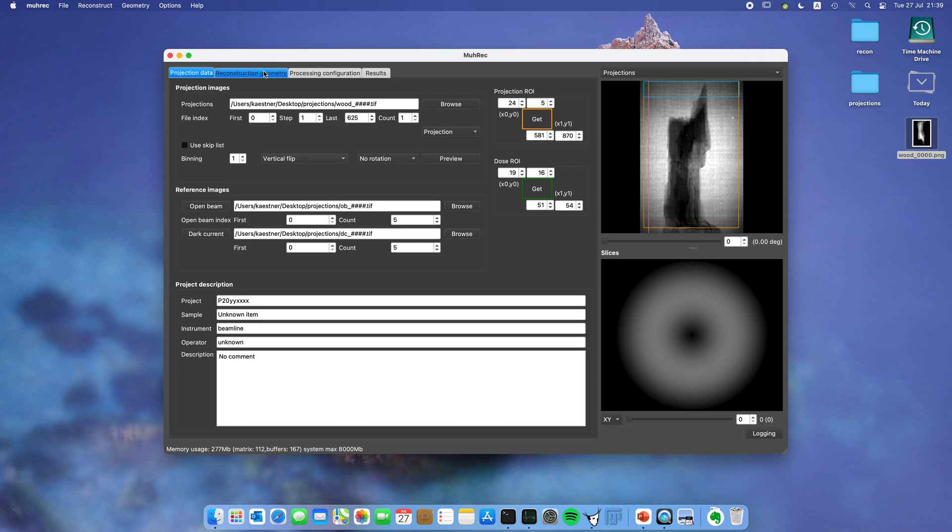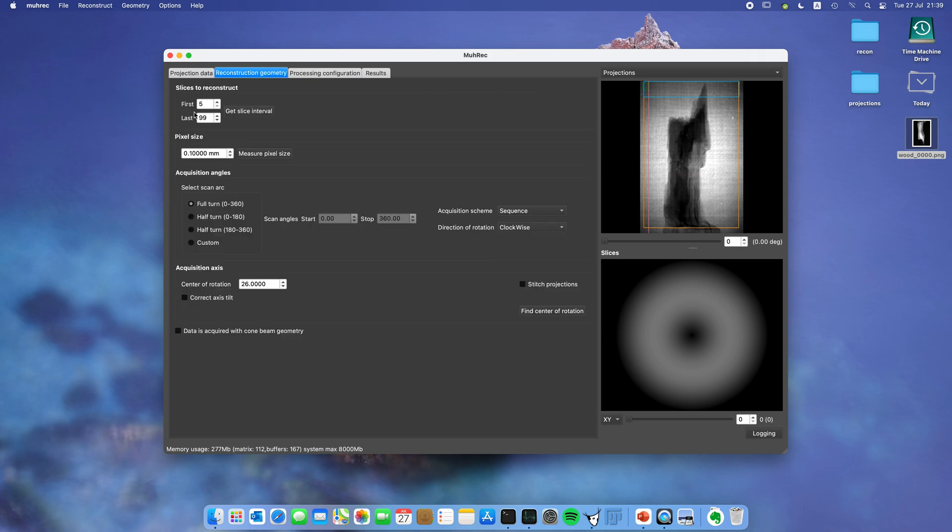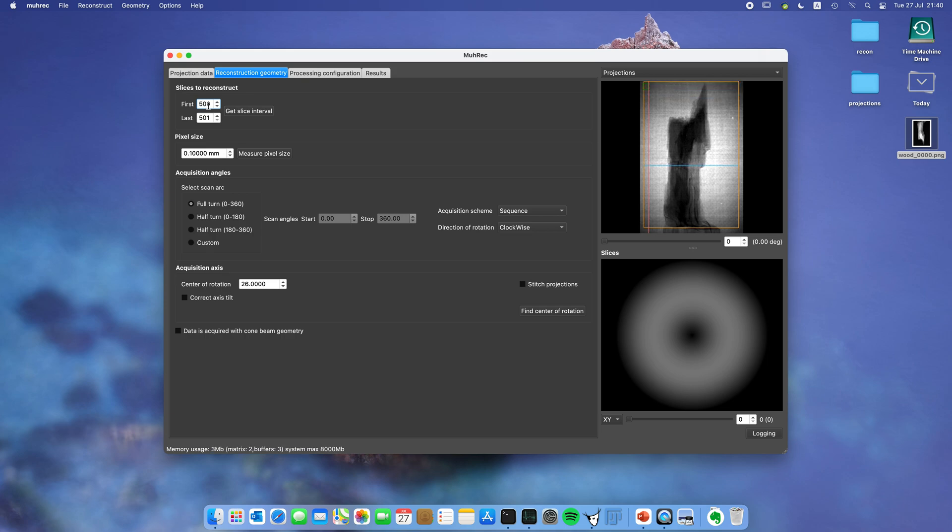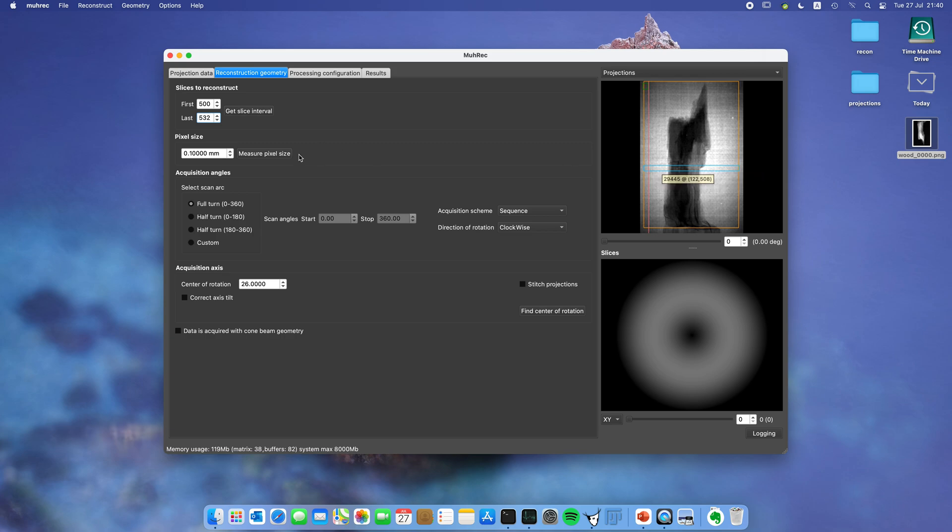Here you can select which slices you want to reconstruct. You can never reconstruct less than four slices, but I actually recommend that you do something more. For internal reasons in the software I recommend that you use 32 images, so let's do something like 500 to 532. You can see here the blue region is the region that will be reconstructed. Next is the pixel size. I'm saving that for a later tutorial, but it's very important that you set the pixel size to the right value, not only for correct display but also so the attenuation coefficients that are reconstructed get the right values.